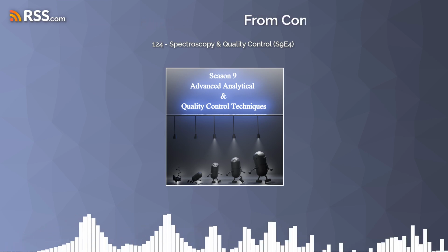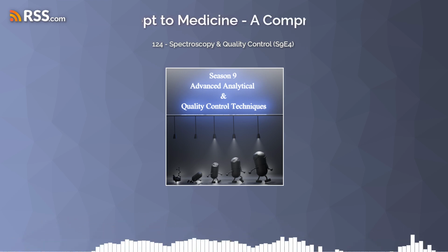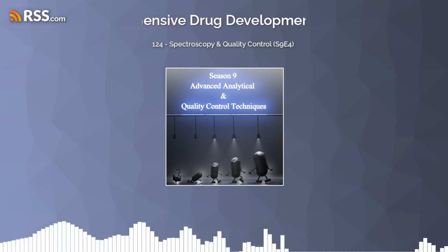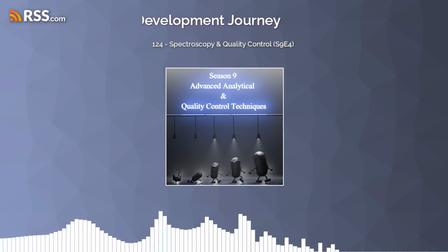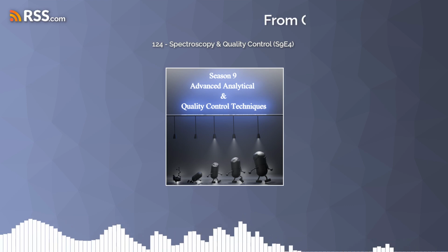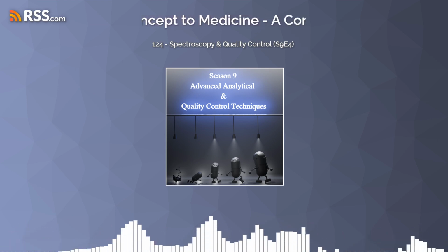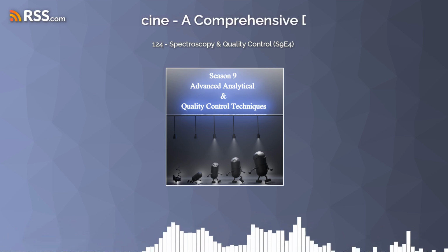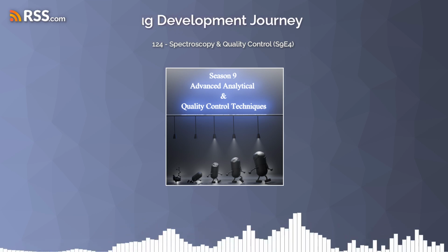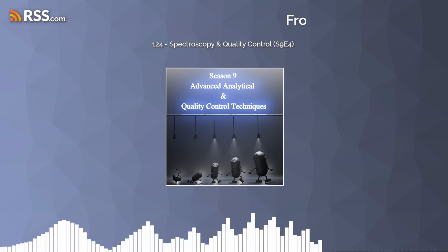And then NMR can even be used to study reaction conversion during formulation. So how much of the starting material has actually been converted into the final product? And it can also be used to look at the impact of different additives on the formulation. So things like preservatives or stabilizers that are added to the drug to help it last longer. All the inactive ingredients. Exactly. So it's really about understanding not just the active ingredient itself, but how the whole formulation behaves. Absolutely. How does it dissolve? How stable is it? All these things are important.